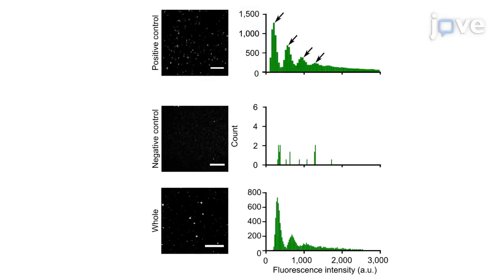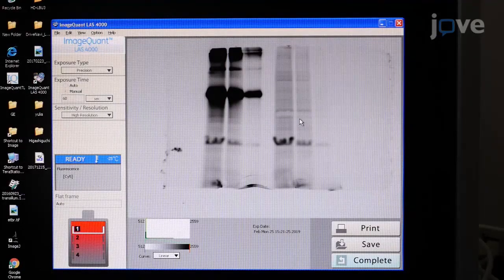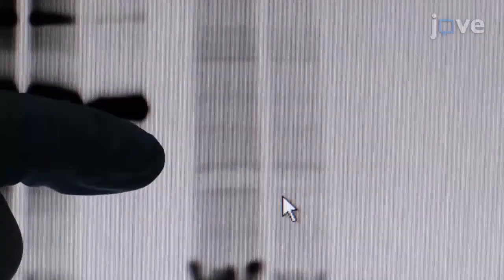This method demonstrates the calculation of quantifying protein amount in liquid sample with single molecule fluorescence spot counting. Specifically, it can elucidate how protein populations can be fluorescently labeled at each molecule level. Previous methods performed bulk measurements to analyze molar ratios of fluorescent and protein molecules, but they cannot reveal how heterogeneously protein populations are actually labeled. Our method can do it directly at the single molecule level.